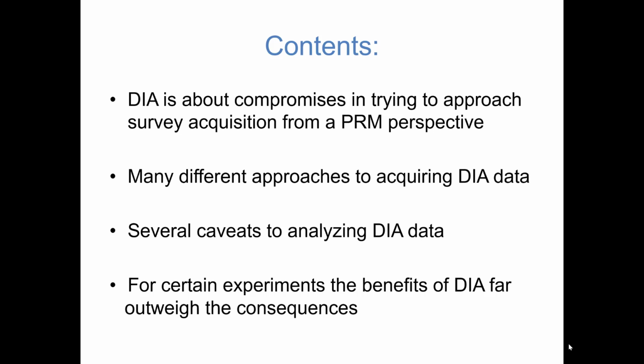In this afternoon session, I'm used to this being a one-day workshop, and that's it. That's all we get. 3 days is fantastic. So tomorrow, I'd like to talk about how the data analysis works to give you a feeling for what search programs are actually doing with the data, to give you an interpretation for when you can know when it's going to go wrong, basically.